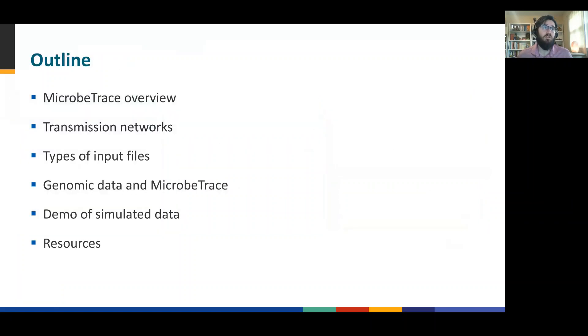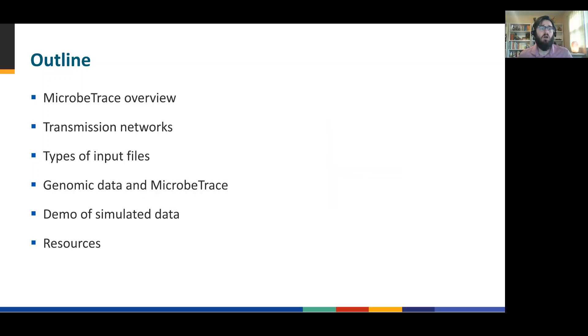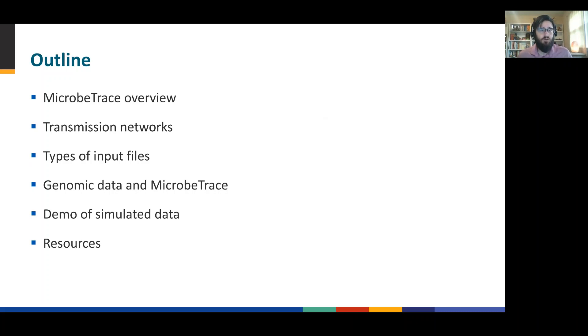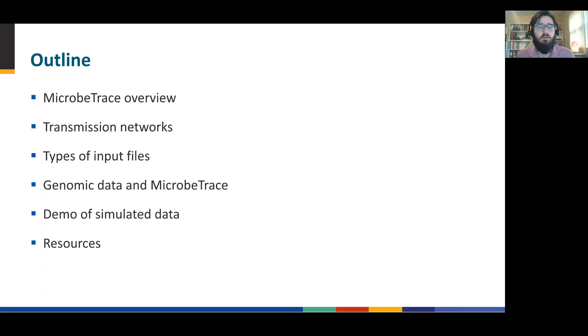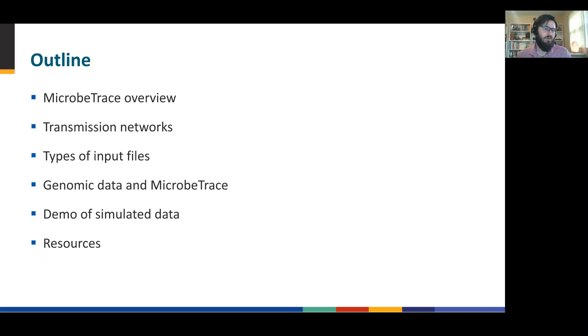Going through an outline here, we'll begin by covering and introducing Microbe Trace. We'll look at transmission networks and the different types of input files you'll be able to use, as well as diving into some genomic data in Microbe Trace. And then finally, a demo using simulated data and an introduction to resources for you to continue your learning.